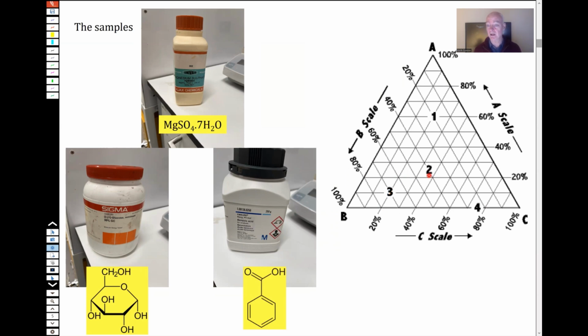So that's the way to read the graph. And you've already decided how best to make your calibration space. I mean, you may well have decided these are good spots. I'm making these up. I'm not saying these are good at all, but that's a way of doing some of the calibration space to try and understand what's going on. And there are different ways of doing it, and you use design of experiments to decide how best to do that.